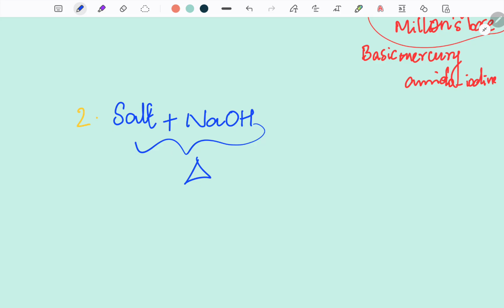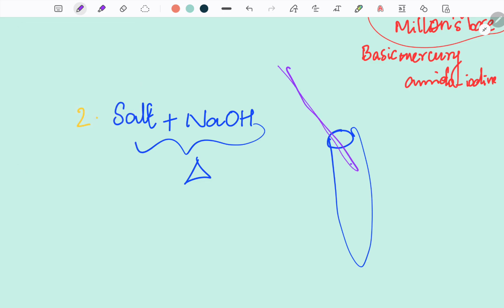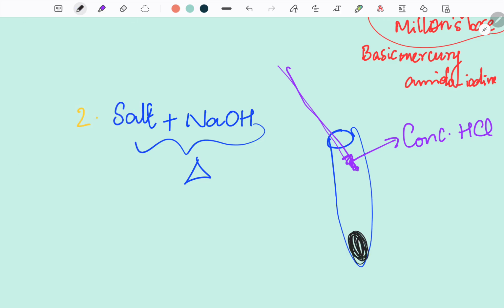Okay, I will explain again. You need to take the salt first, and then add NaOH. So you will get a solution.